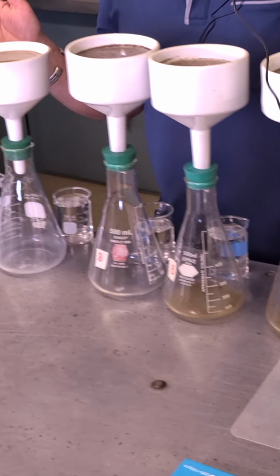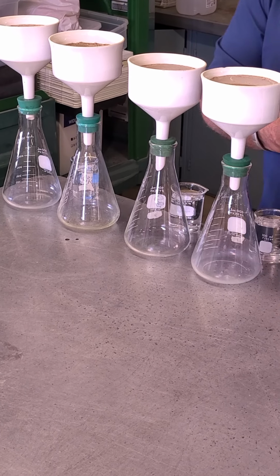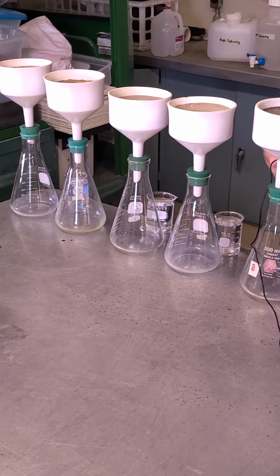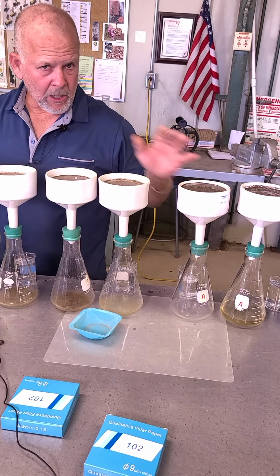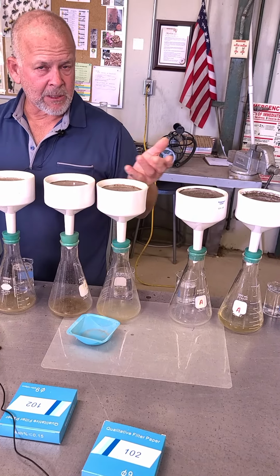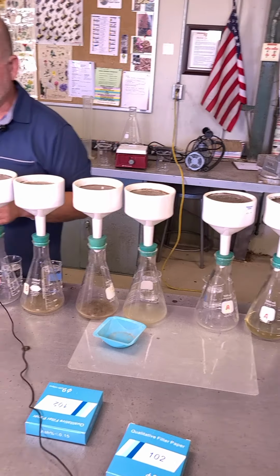Here's a silty clay loam. This has got a lot more clay in it than the other 2 textures. But I will draw your attention, this is the loamy sand, and this is the loam. Okay, loamy sand and loam. So I keep saying these things to you because I'm going to ask you questions about the different textures and what you're actually seeing here.